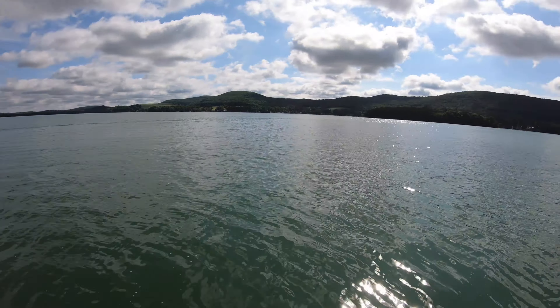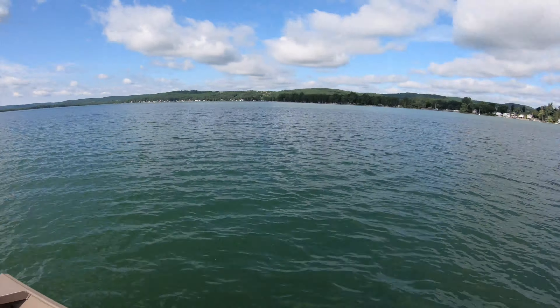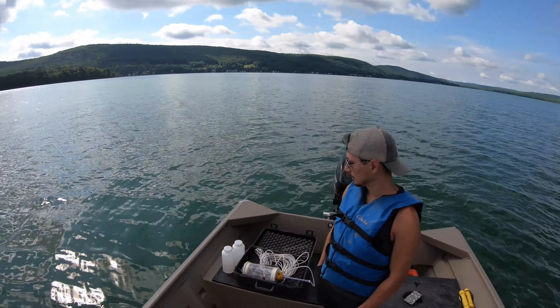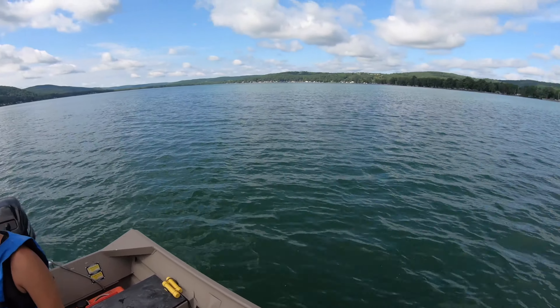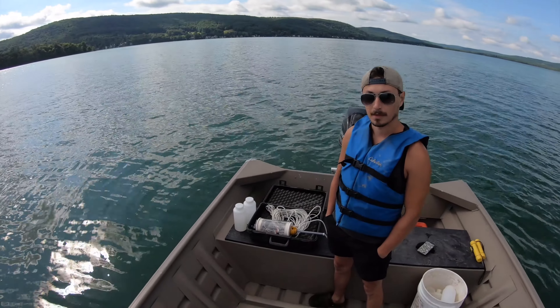Hello everybody, Sam and Matt. Today we are here on the beautiful Cana-Dorago Lake. We're going to be doing a ton of sampling today: water qualities, invertebrates, plankton, plants, all the good stuff. We're going to be showing you how to do that today.